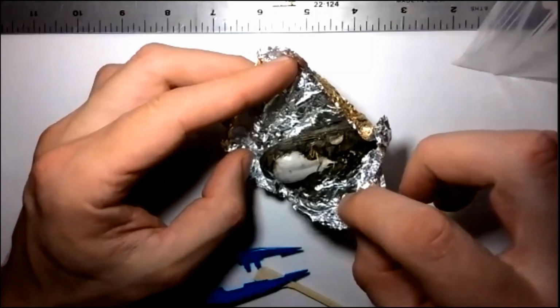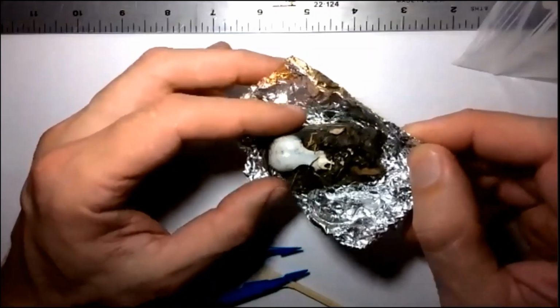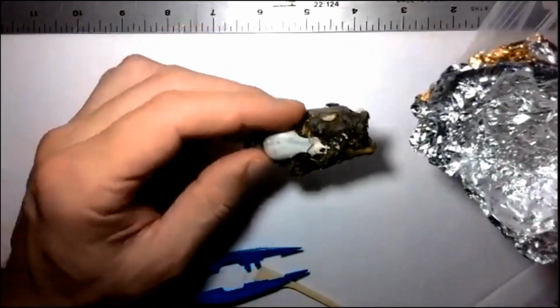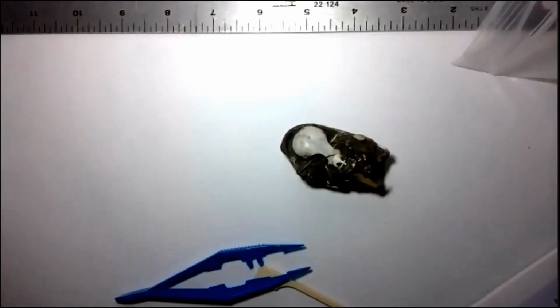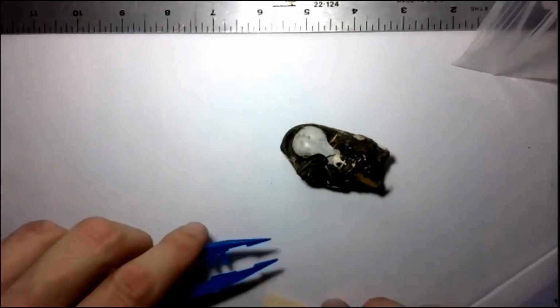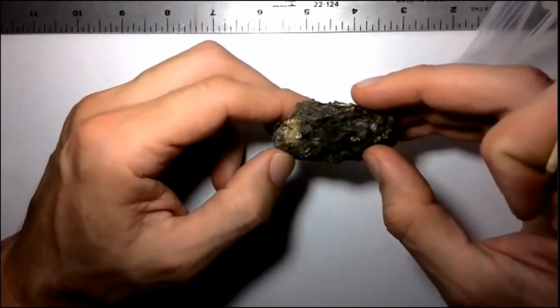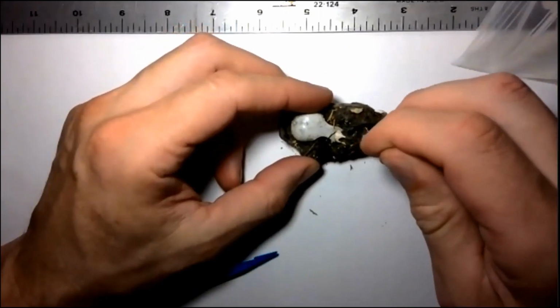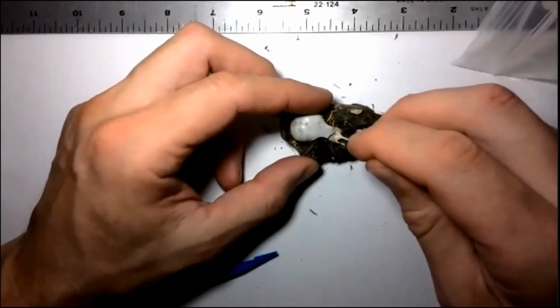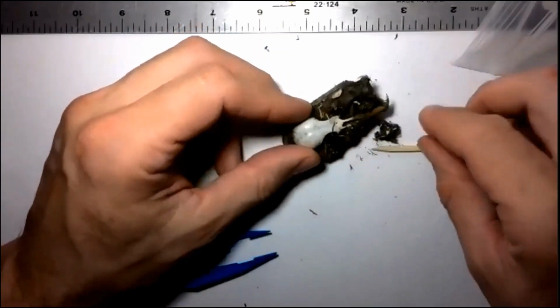Wow, that's one of the best starts ever. That was incredibly easy. Wow, this is, oh, you know, there's not a lot of mystery in this one. This is funny. You never know what you're going to find with owls. This particular one has a huge bird skull. And you don't see this very often. Actually, this is the first time I have found a bird skull in mine.